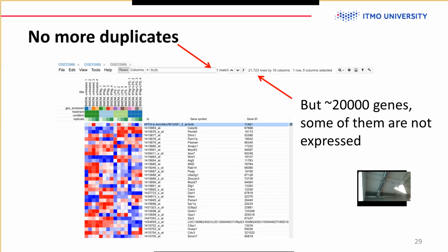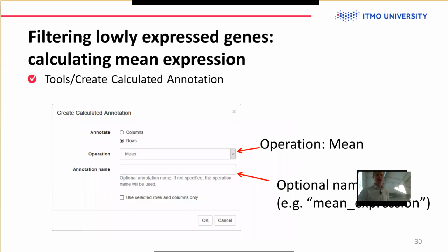However, as I said, in microarrays they have this cross fluorescence, so you don't have 0 values. So it's hard to say, as there are signal measurements for every probe and for every gene. However, there is one simple way that we usually deal with it, which is to filter the genes by the average expression and get some kind of top of the highly expressed genes.